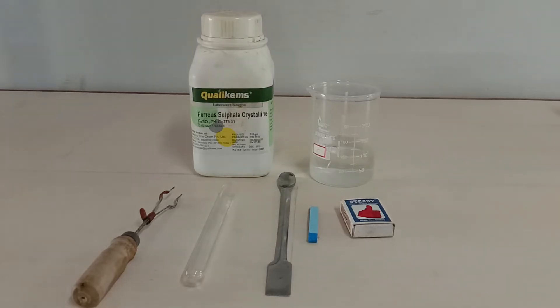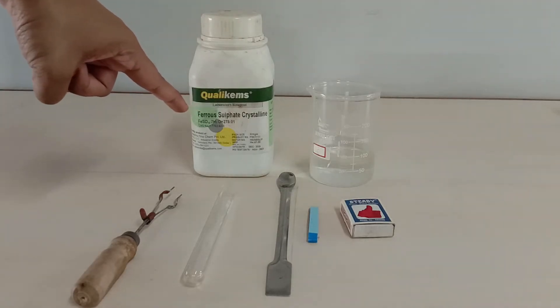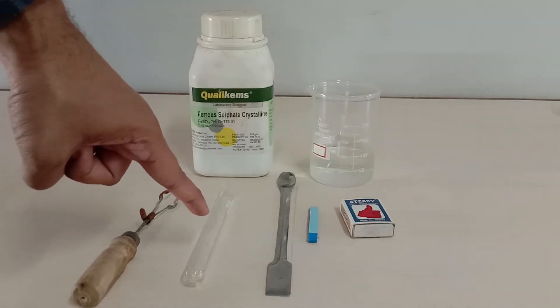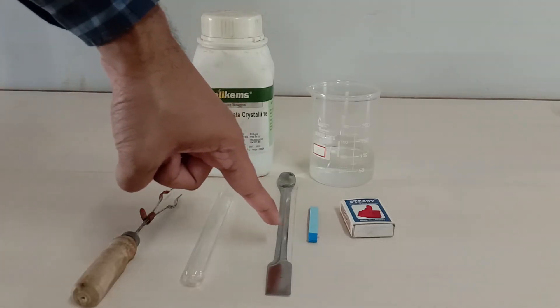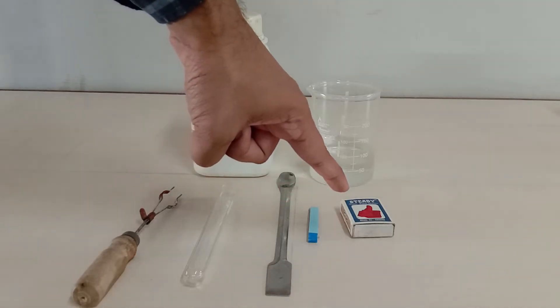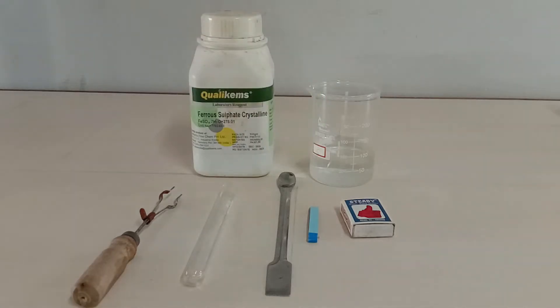For this experiment we require ferrous sulfate, a test tube, test tube holder, spatula, blue litmus paper, a matchstick box, water in a beaker, and a Bunsen burner.